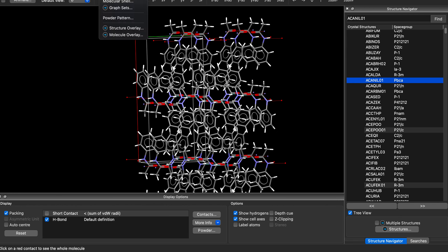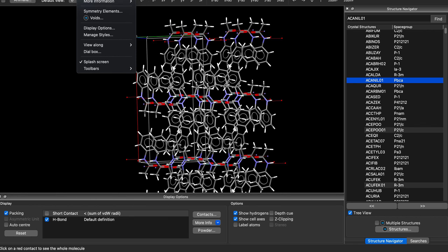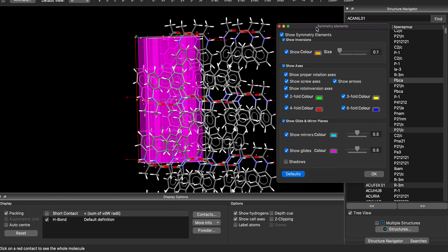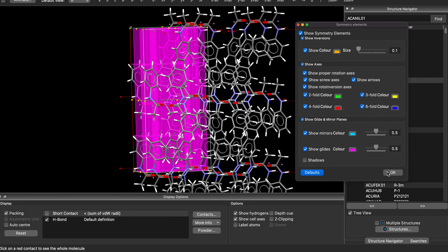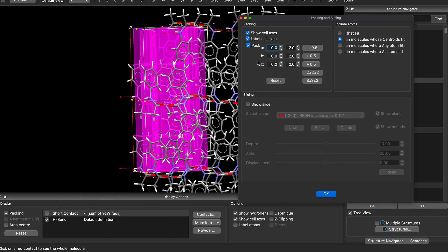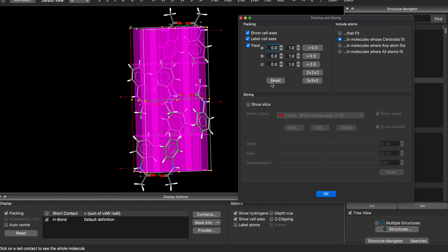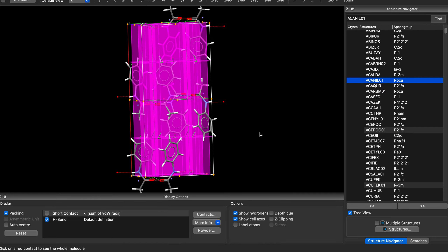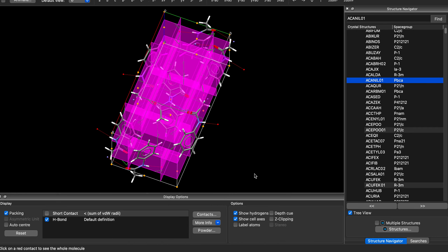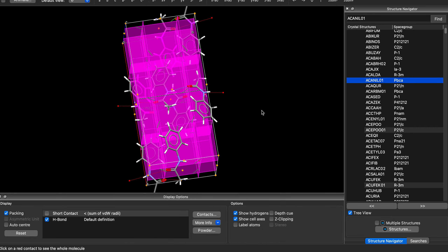Another thing I find useful is to see the symmetries. Under Display > Symmetry Elements, it will show you what the symmetries are. It might be easier to see them one by one. You can go to Calculate > Packing and Slicing and reset, and you can see where the mirror planes are, where the inversion centers are, and so on.